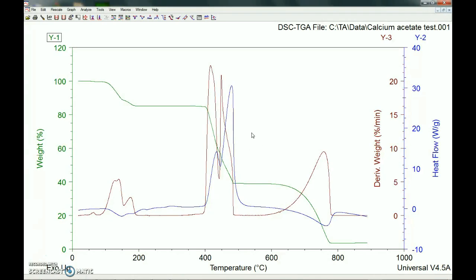So here's what we get when we open it up. On the y-axis here, you'll see weight percent starting at 100 and going down to pretty much zero. On the x-axis, you'll see temperature going from zero to a thousand Celsius. Remember our experiment run was set to a constant temperature ramp at 20 degrees Celsius per minute, up to 900 degrees Celsius. The other things we'll see here on the other two y-axes, you'll see y2 in blue, which is heat flow, and then y3, which is derivative weight percent.